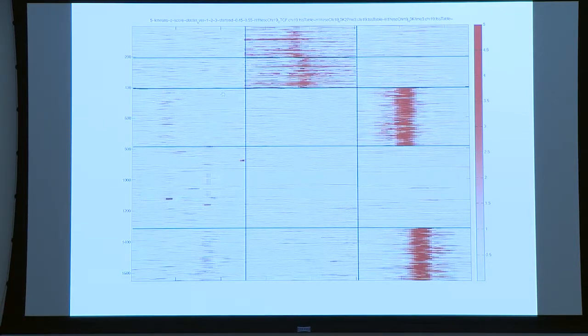The regions we defined in the bed file were all the transcription start sites, approximately 1,600 genes on chromosome 19. So it's all the promoters of chromosome 19. And promoters we defined as the transcription start site plus 2.5 kb in each direction.